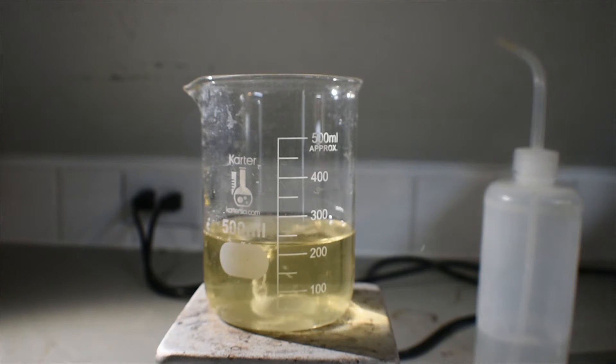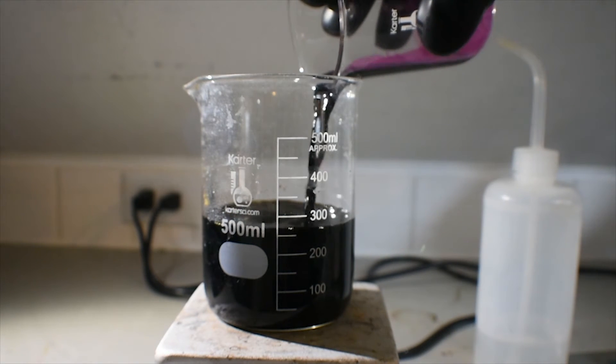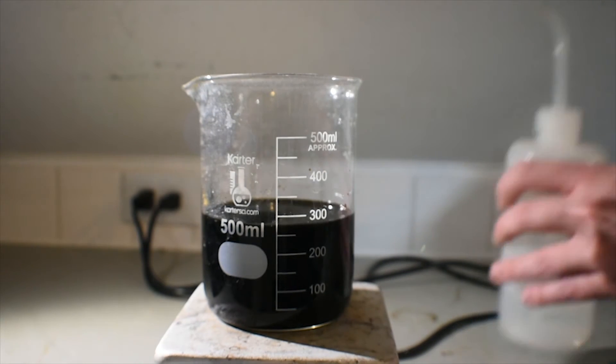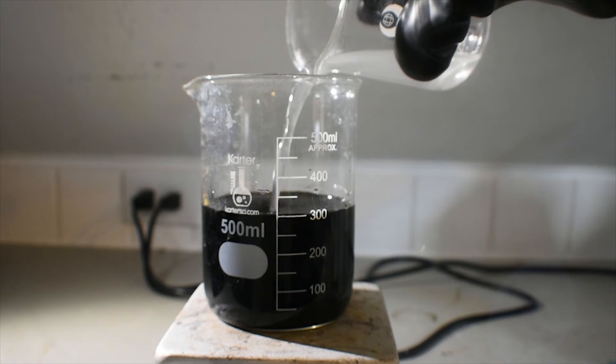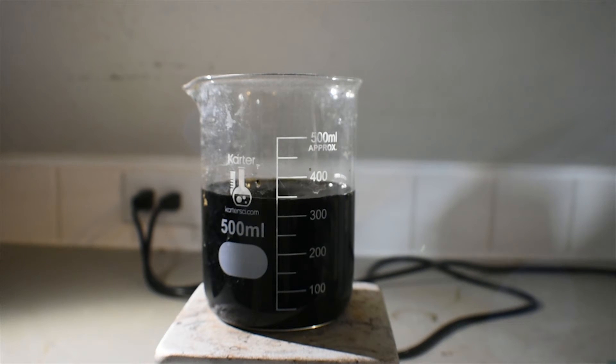Now it seems that all the acetyl acetone is dissolved. I'm going to slowly add the potassium permanganate solution to this acetyl acetone and manganese-2 solution. You can see the nice brown color of the manganese-3 being formed. Now that all of the sodium acetate is done dissolving, I'm going to add the sodium acetate solution to this solution. I can already begin to see some of the manganese-3 acetylacetonate complex crystallizing out — it has some beautiful black crystals on top of the solution.